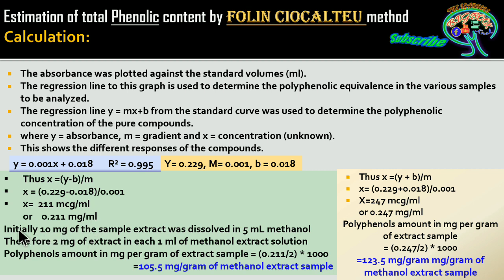Now here, during the preparation of the reagents, we discussed that 10 milligrams of the sample extract was taken and dissolved in 5 ml of methanol. Therefore, each ml has 2 milligrams of extract in the methanol extract solution.